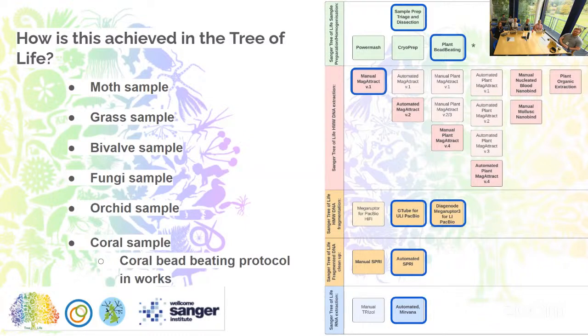And then quite a recent example from our Aquatic Symbiosis Genomics project, coral samples. Actually, we've managed to work up a really good bead beating protocol for those. So they then go into ULI or long read library prep.